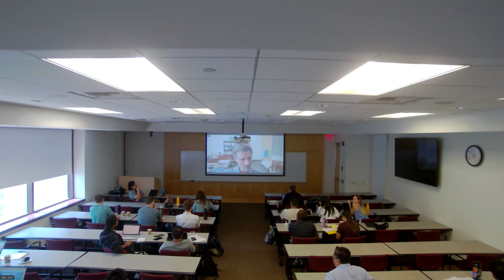Eric, can you give us a sense of the drop-off in the intensity of that image from the top surface to the bottom of that frame? Do you actually adaptively scan more at deeper layers than at the top? I imagine the intensities are quite different from the top down to the bottom. Or maybe am I mistaken? I have not done the analysis on the image. By eye, it looks like there's maybe a drop off by a factor of 2.